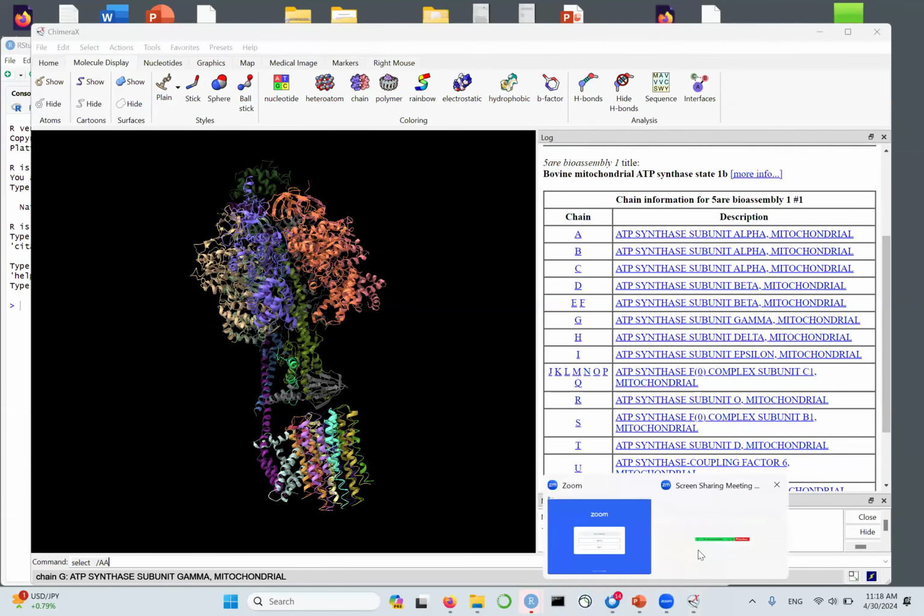You can read the file into Chimera, move the molecule around, and see if you can find the residues or parts of the molecule that they refer to in the write-up. So anything that helps you to play with Chimera is helpful, and this is the only way to learn how to use it. It also helps when hearing stories in a class about whatever protein, or reading a paper referring to structures. It's a different story looking at the figure in a book than just loading the file, and then if you can move the molecule around and zoom in, zoom out, it helps to see what the paper is about. So Chimera is useful as a tool when reading anything about molecular biology, and when there is any structural element, just try to play with Chimera. It's free, so try to use it.